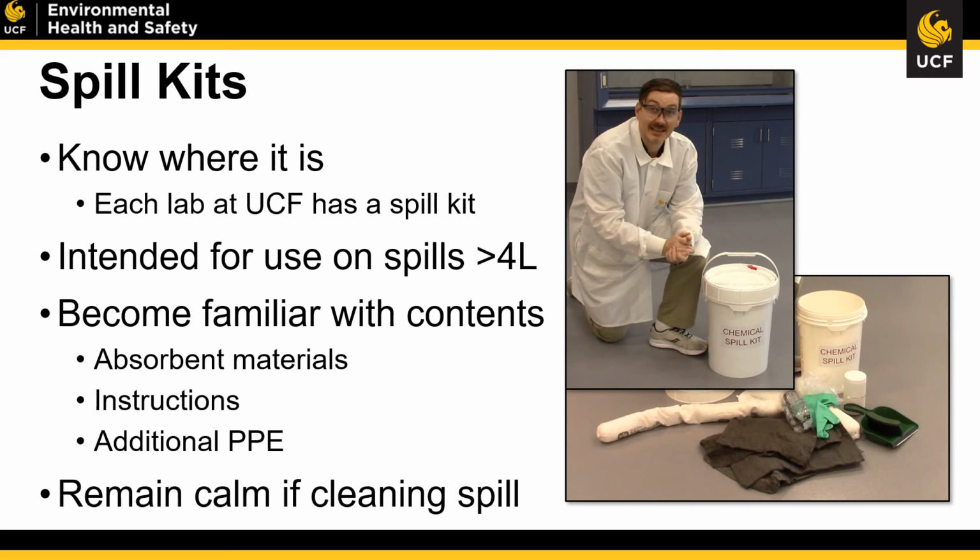I will always encourage you, before implementing any type of spill procedure, take a moment, calm yourself, and center yourself. In the event that a spill occurs, we all like to get it cleaned as quickly as possible, but keeping a calm, level-headed mind is going to be the best course of action as you go to mitigate the spill. Each spill kit provided by the Environmental Health and Safety Department contains a variety of different pieces of equipment to assist you in cleaning the spill.